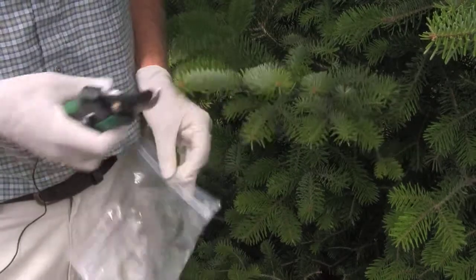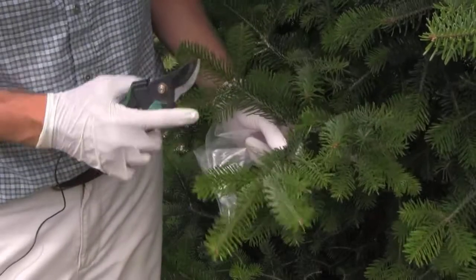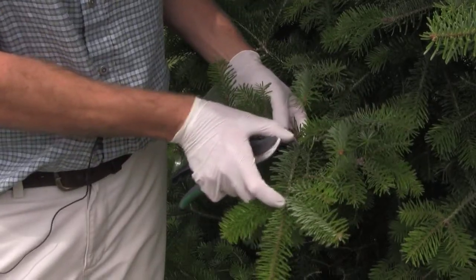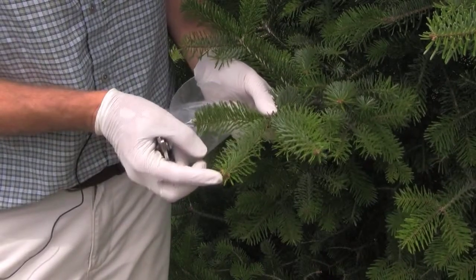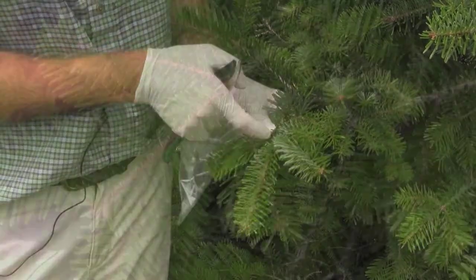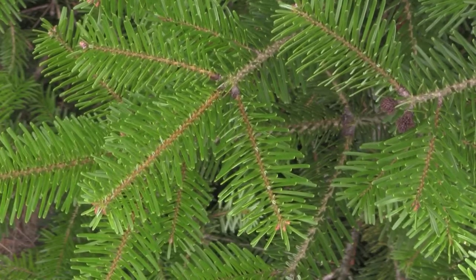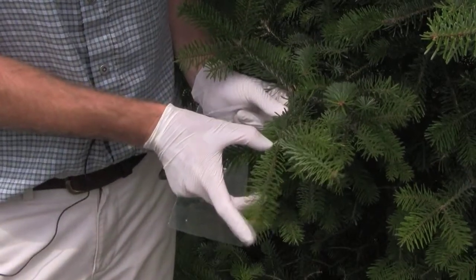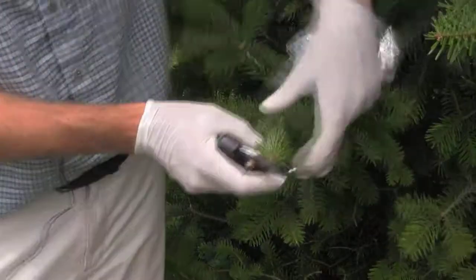The most important thing to start with is identifying the current year's foliage. We can see growth from 2010, 2009, and 2008. The best way to distinguish them is to start from this year's bud being formed and go back — you'll see a bud scar from last year and a distinct change in the color of the twig. Almost all recommendations are based on current year's foliage.